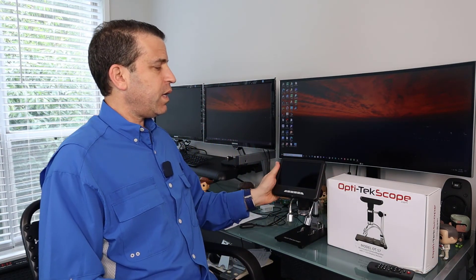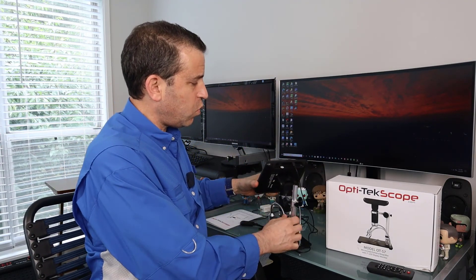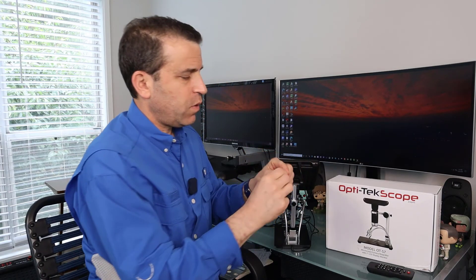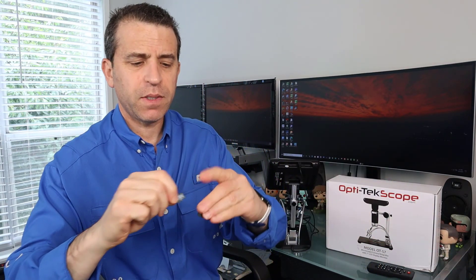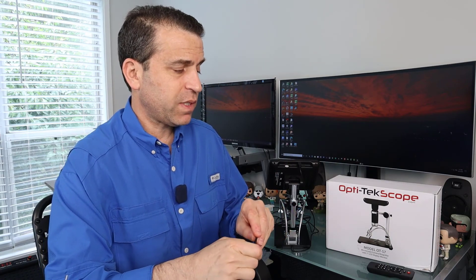With the microscope, you can just use the screen — you don't need a computer, which is nice. If you choose and do want to look at and save files, there is a micro SD slot. Most of these come with a little adapter piece that you can plug right into your computer. You can do up to a 32 gigabyte micro SD card. You can shoot video as well as photos and then you are good to go.